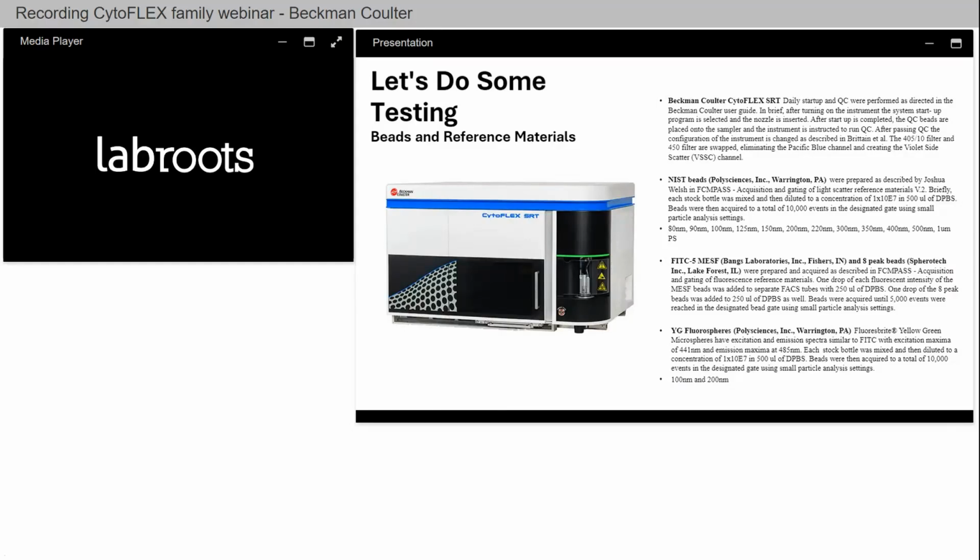So the Cytoflex SRT, the reason we started to try these projects on it is it was deemed and is still deemed the Cytoflex that sorts. So if we could do certain things on our Cytoflex S and LX series, well, why couldn't we just translate those over to the SRT? And as stated right at the beginning of this, I had always been trying to use sorters to isolate particles. So I had the methodologies already in place. I had a system now that was very similar to things I was doing for our acquisition aspects. And so why not try it?